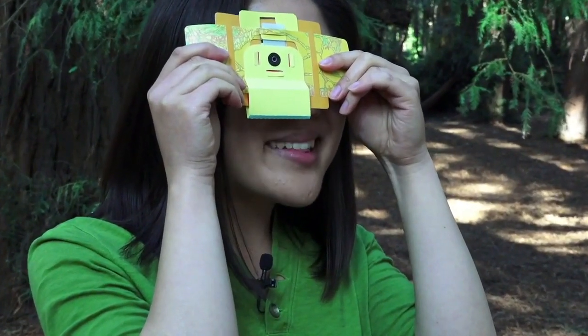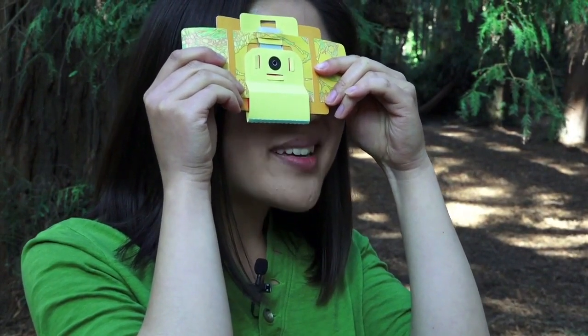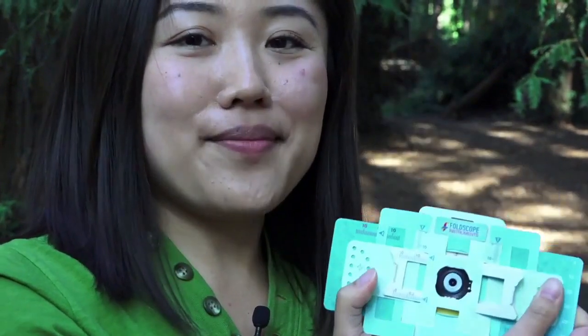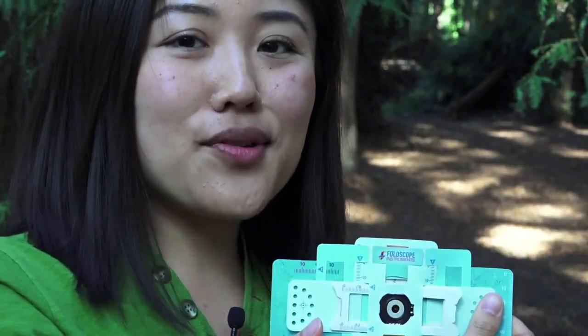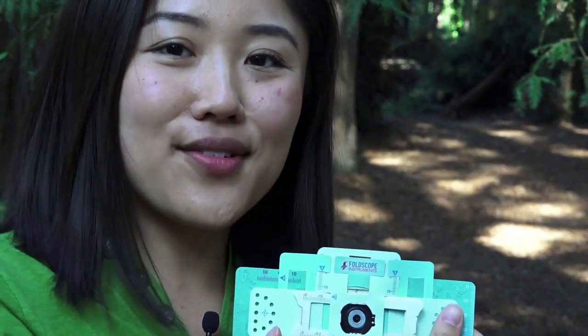The ambient light when you're outdoors like I am right now, it's bright enough to see a very clear image of your sample. I'm seeing beautiful cell walls of the fern rhizome specimen that I have right now in my foldscope.